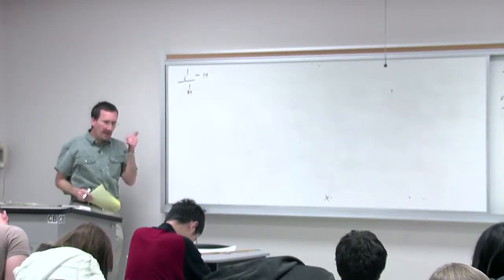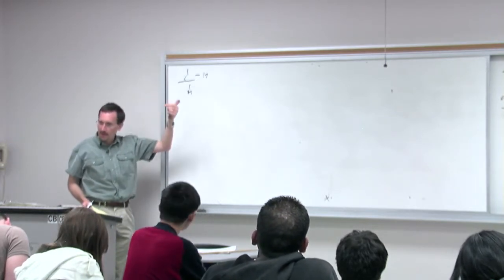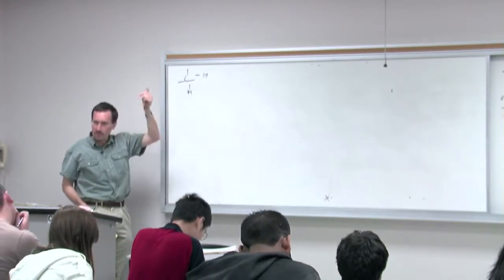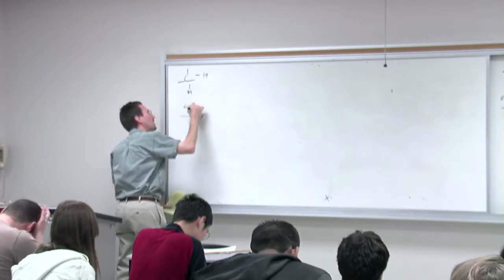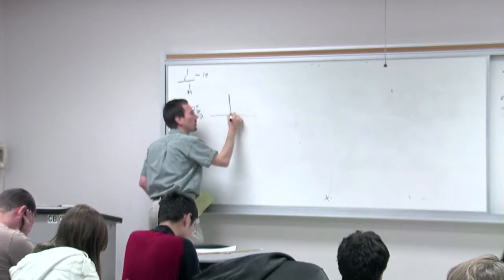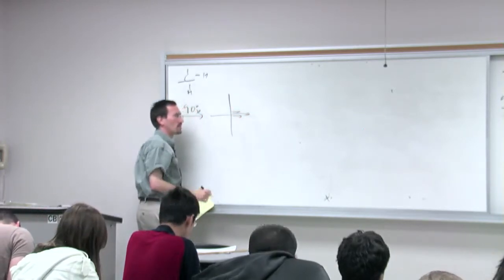So you've got a vector that's going at omega, and a vector that's going at omega plus J, and a vector that's precessing at omega minus J. So we apply our 90-degree x prime pulse. You end up with the situation where you can think of this as 3 vectors comprising your triplet.